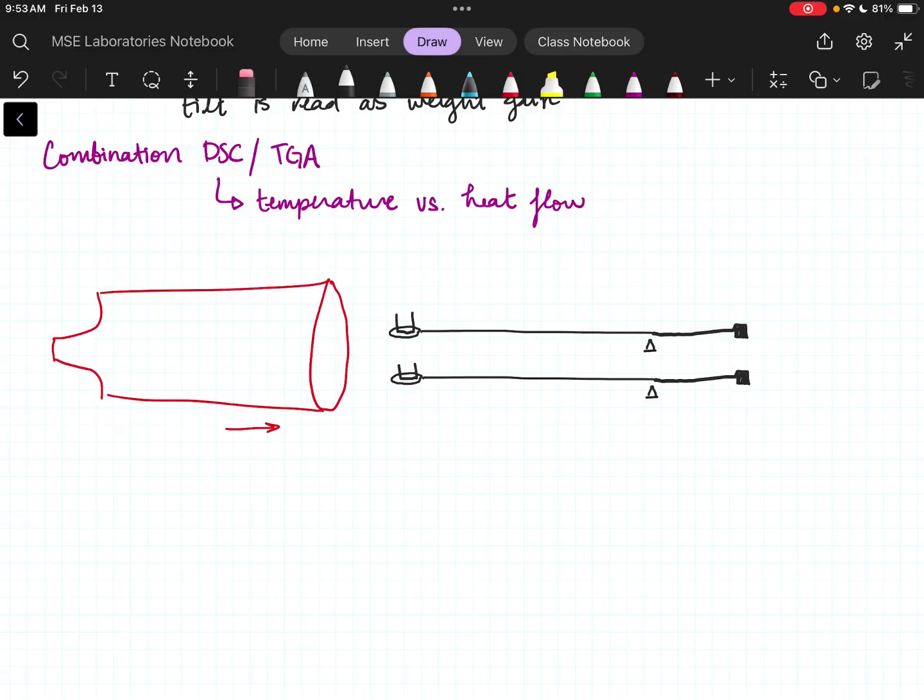And some things, like ice melting, have no mass relationship. There's no mass change when ice melts. Some things, though, going back to my baking soda, washing soda, I'm adding heat and my mass is changing, and I probably absorbed some, or let's see, I'm actually not fully sure if that would be endothermic or exothermic.